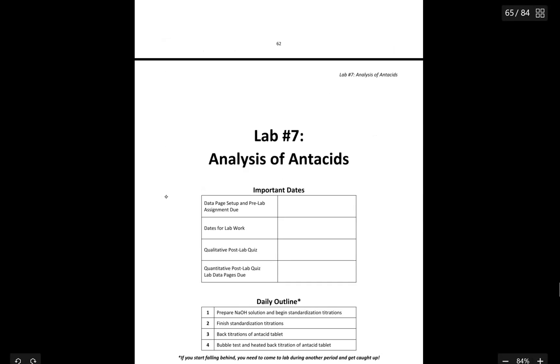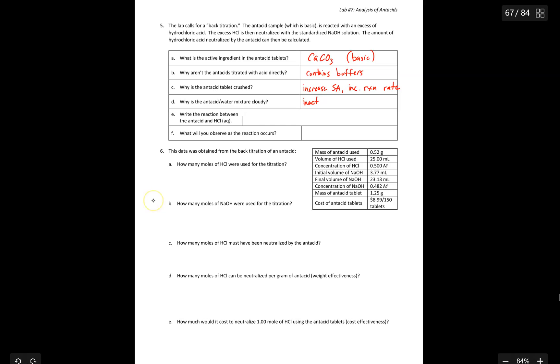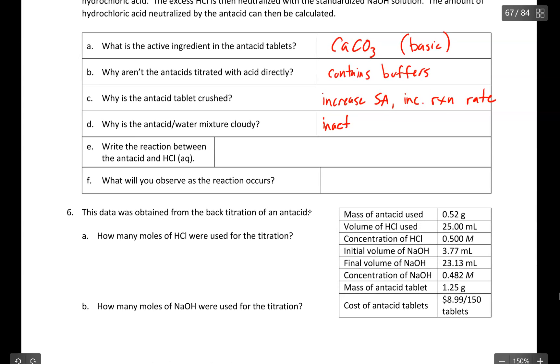So there's a whole bunch of inactive compounds and molecules that are added that shouldn't react, shouldn't cause any issues by any stretch, but will just make the tablet bigger. It's okay that it's cloudy, you just want to make sure that it's stopped bubbling. No more bubbles means that all of the calcium carbonate, all the active ingredient, has reacted, and you just have the binders, the inactive ingredients, kind of still floating around.